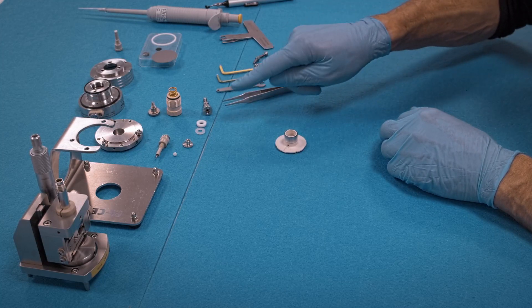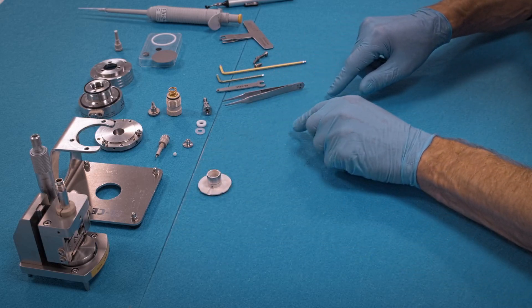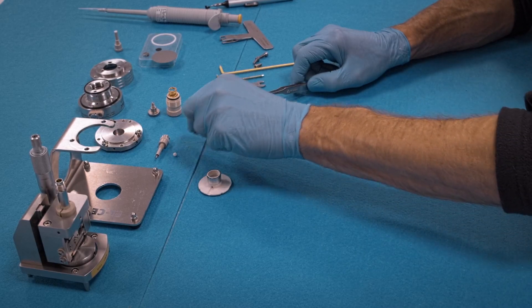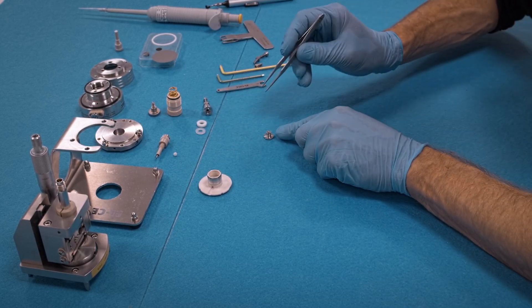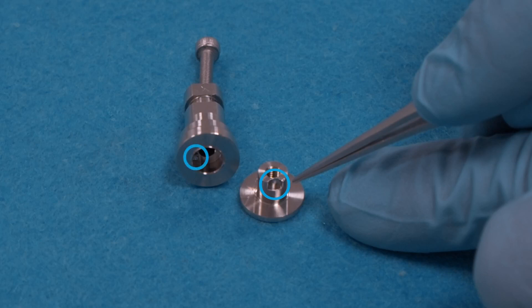Now we assemble the central piston, comprised of five parts. This is the upper part of the piston which has a notch. This notch needs to be aligned with a set screw in the counterpart.